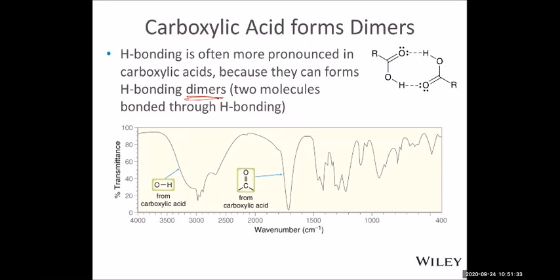Okay, what OH looks like if I draw it on this chart. I'll draw the OH bond. If I draw the OH bond, it looks like this. If this molecule has OH, it looks like a much stronger absorption, much stronger and much wider. It looks like a mountain. These are just like 2 teeth, like the fangs of a snake. The real OH bond is much deeper, stronger absorption, wider absorption. So that's the difference among different kinds of bonding.